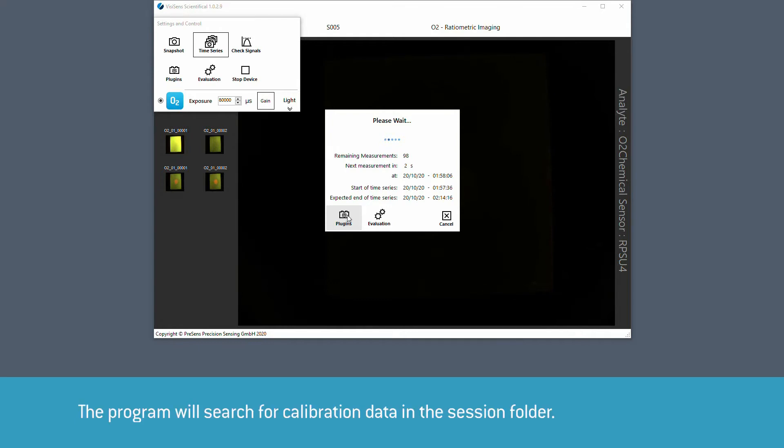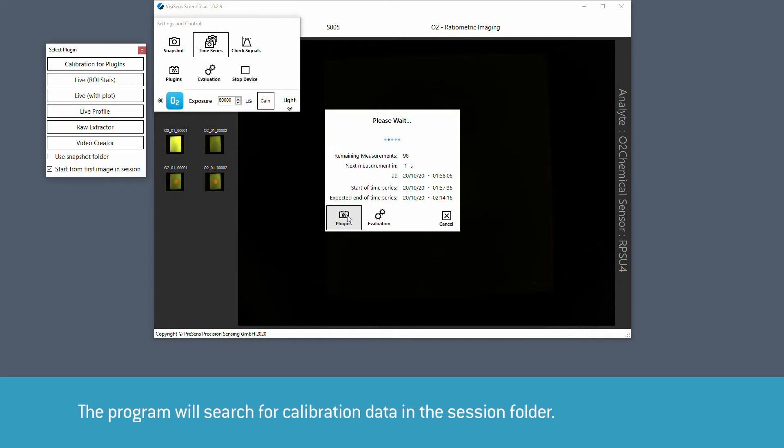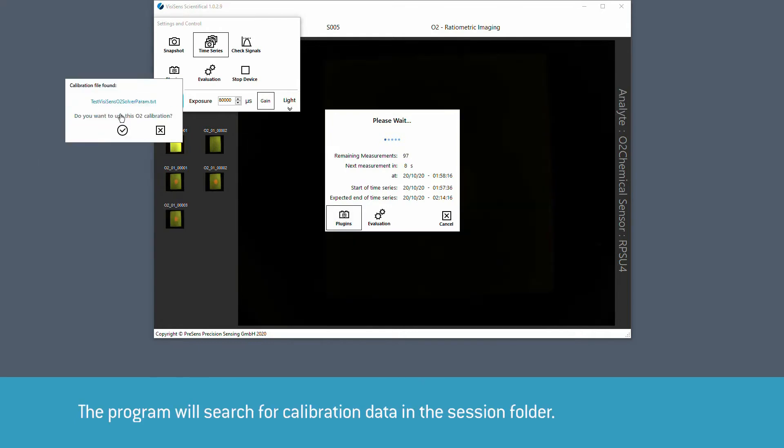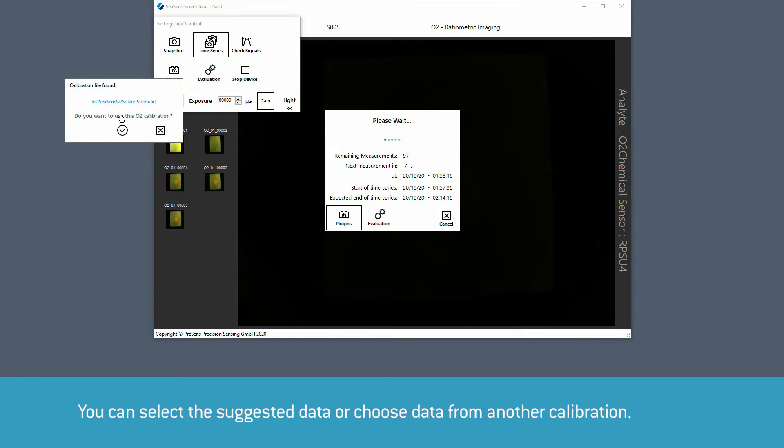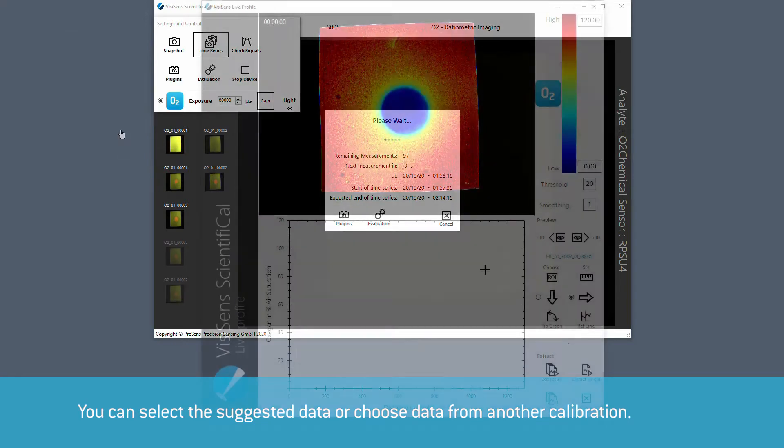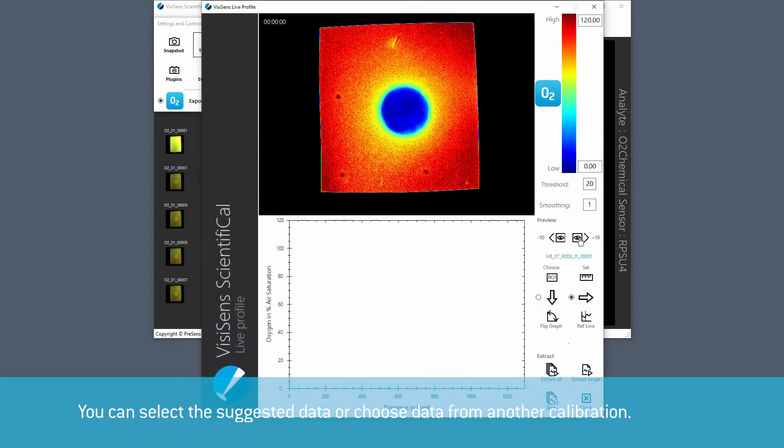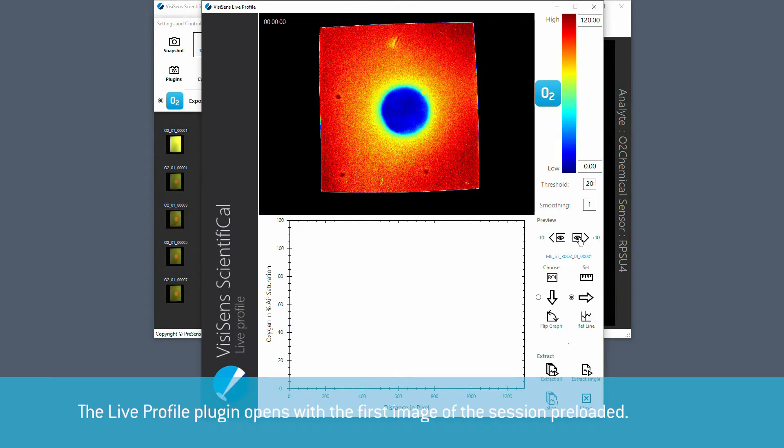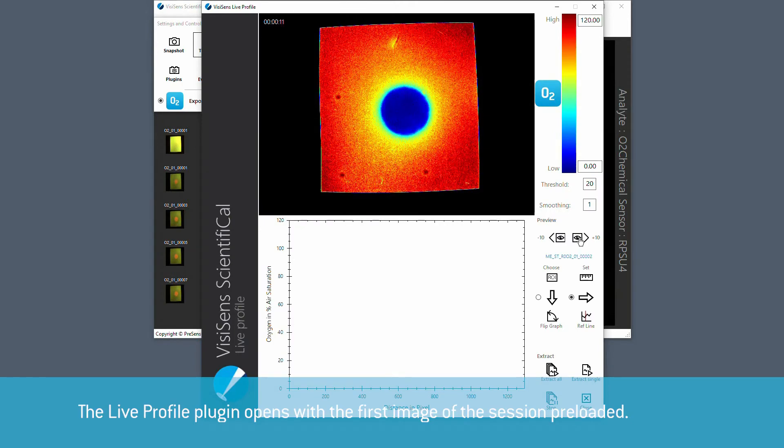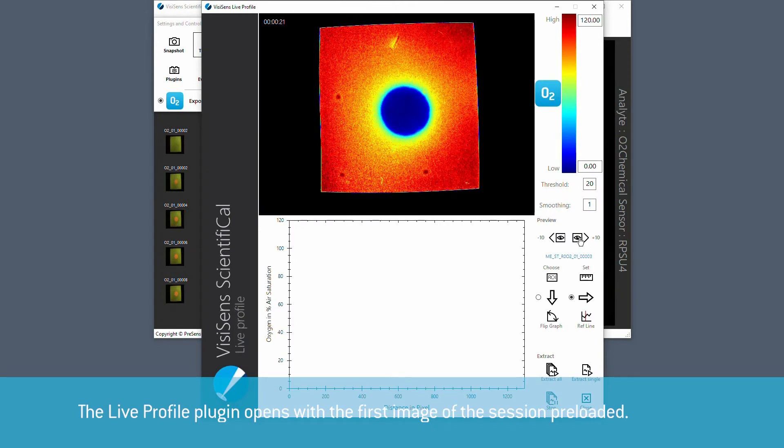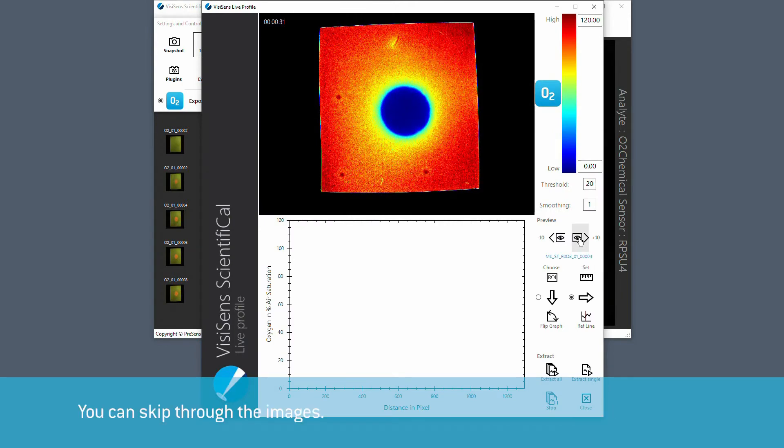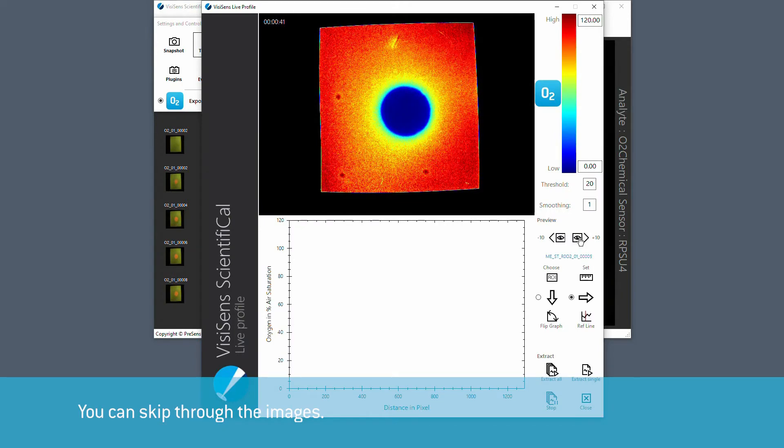The program will search for calibration data in the session folder. You can either choose the suggested data or decline and select another calibration. The live profile plugin opens with the first image of the session preloaded. You can skip through the images.